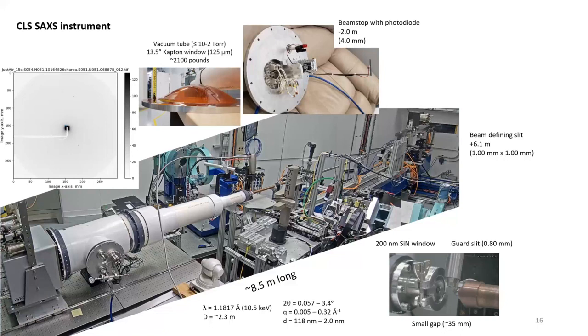Sure. Yeah, I have seen some reports where nanoparticles were encapsulated in dendrimer, and SAXS was able to identify where the dendrimer is and where the nanoparticle is. So if I have some palladium nanoparticle coated with gold or maybe some other metal, can we identify exactly how much thickness of the gold layer over it and how much the core thickness is?